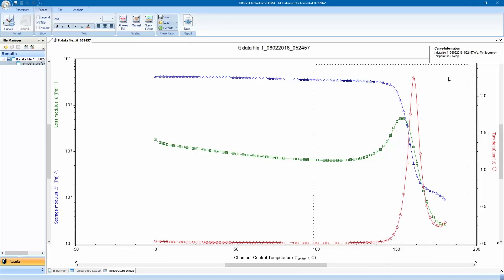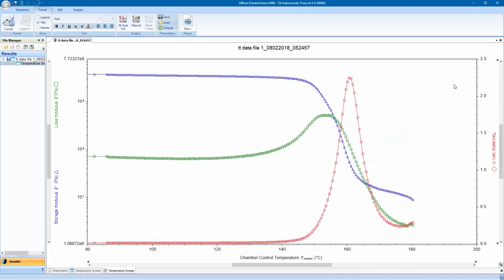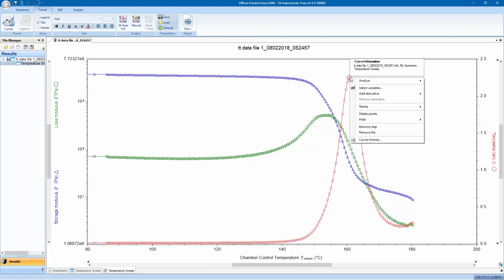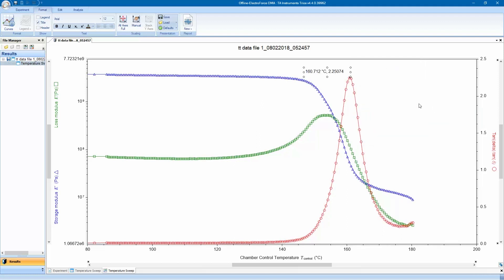After the last condition, the DMA application will open TRIOS, plotting the data file that was just created. TRIOS has many features useful for analysis, plotting, and report generation.